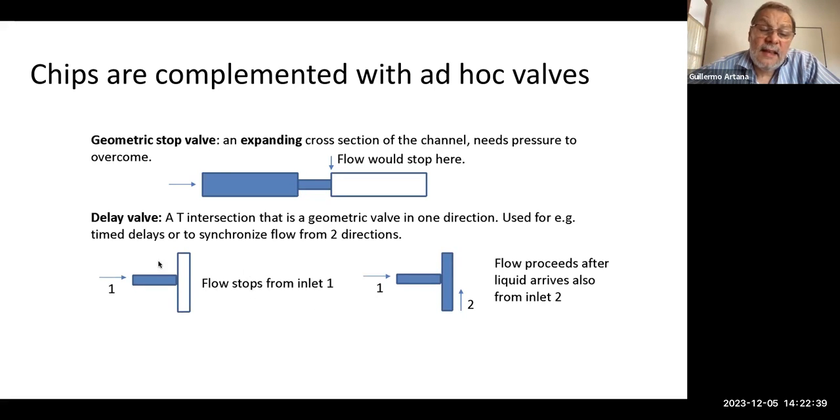Or you can have what we name delay valves, in which you stop the flow, but the flow goes on for some time after you produce the stop of the flow. So I will mention one of them here.